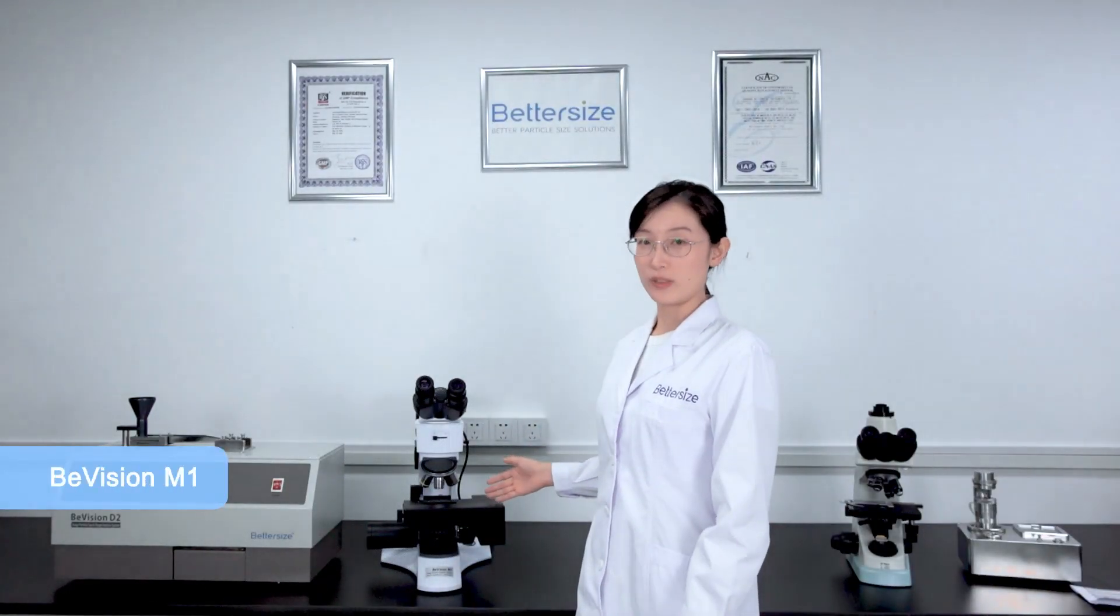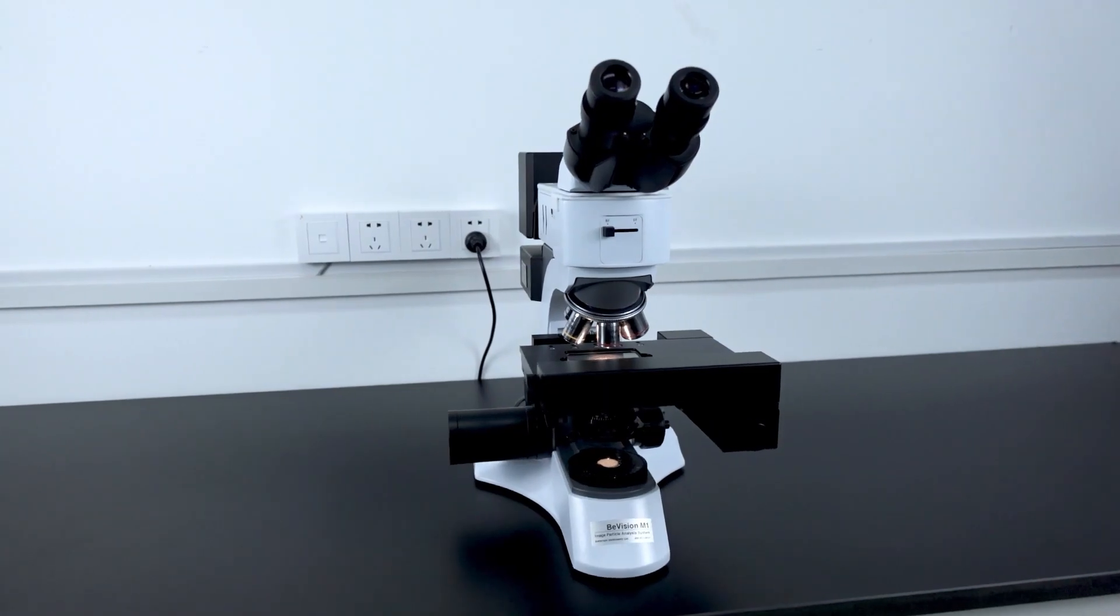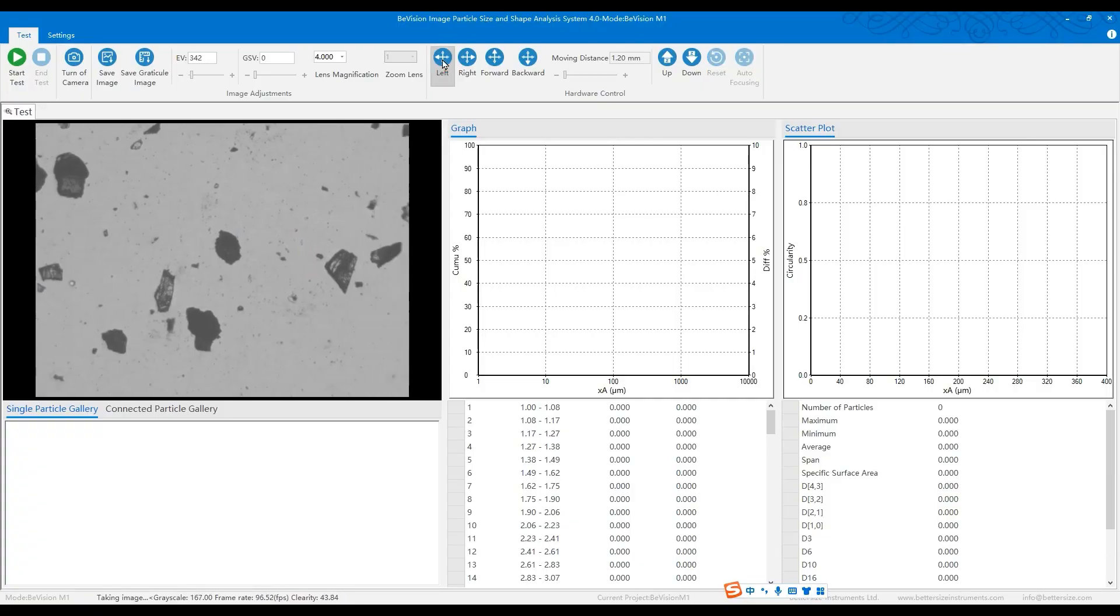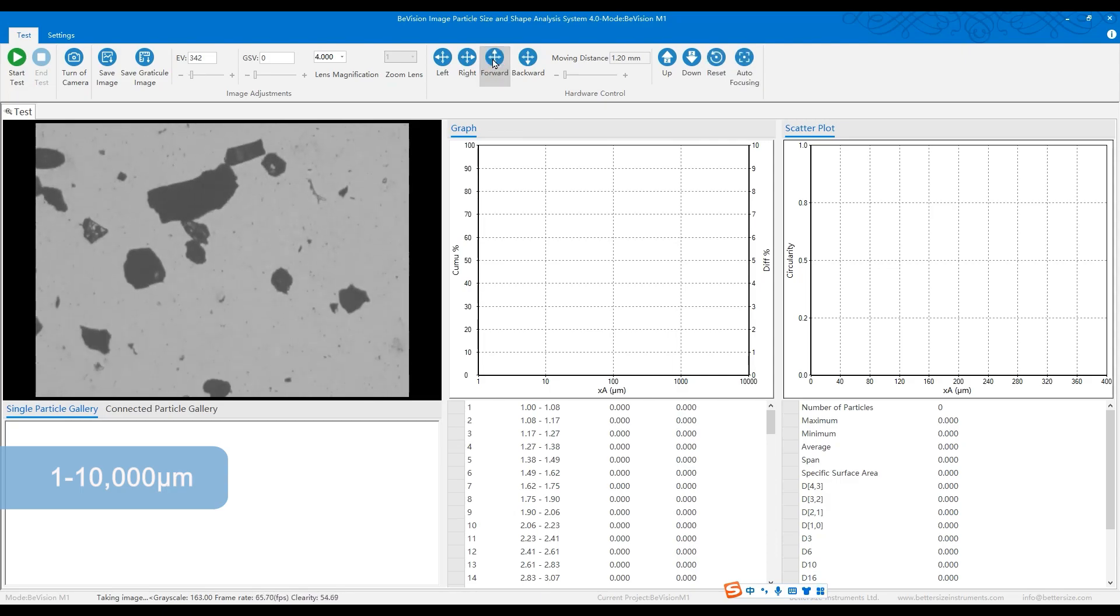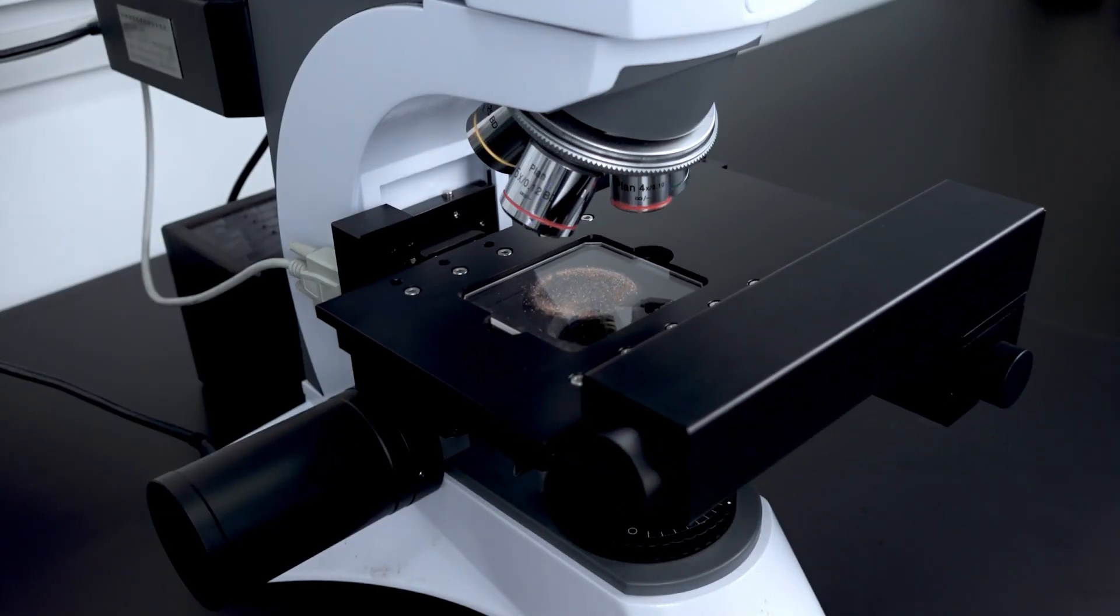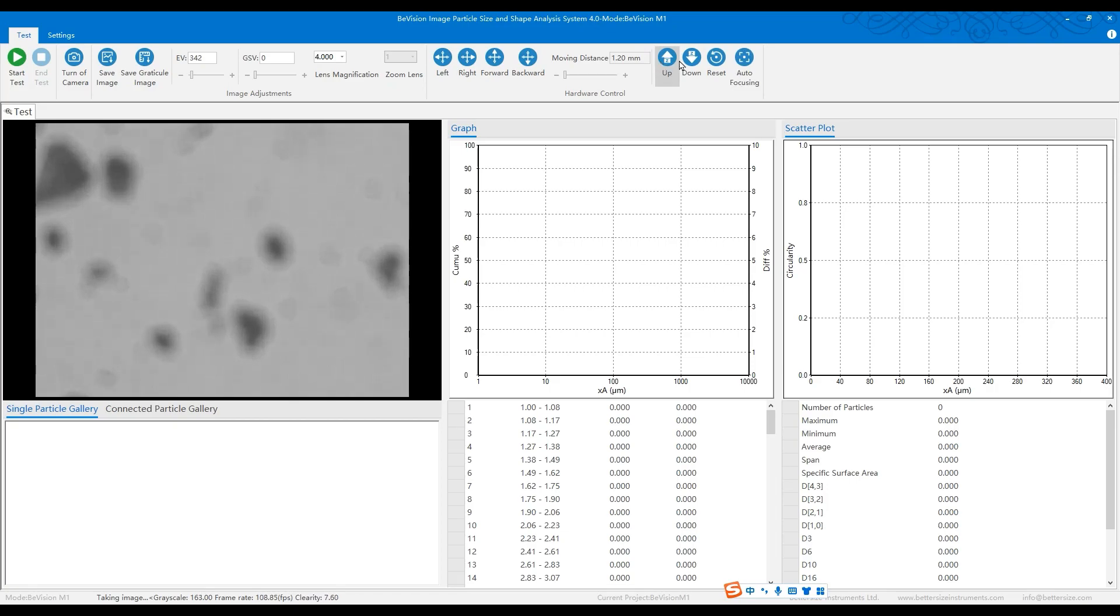Equipped with an auto-moving stage, the BeVision M1 can quickly inspect thousands of particles from one micrometer to 10,000 micrometers without manually moving the field of view while keeping the particles in focus.